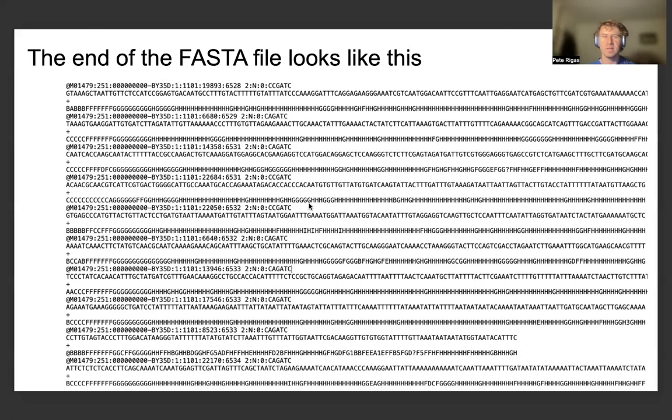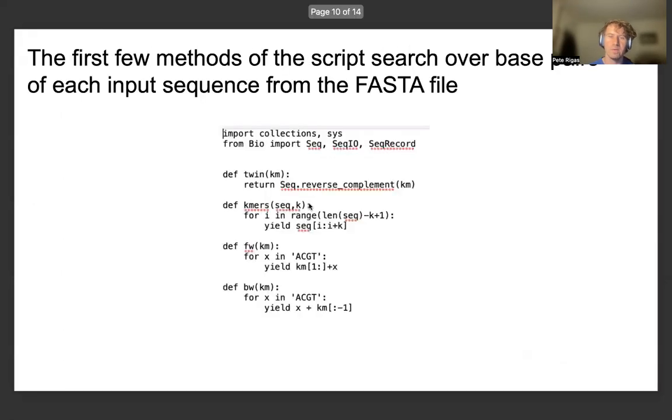So this is just giving an idea of different characteristics in the specific formatting of any one of the DNA sequences which appear in the TXT file from the FASTA file that we're using as input to make these test GFA files that we're going to be able to view and look at more closely in another bioinformatics application.